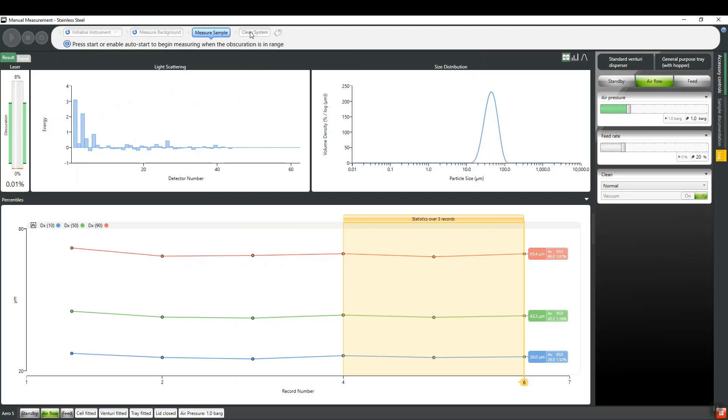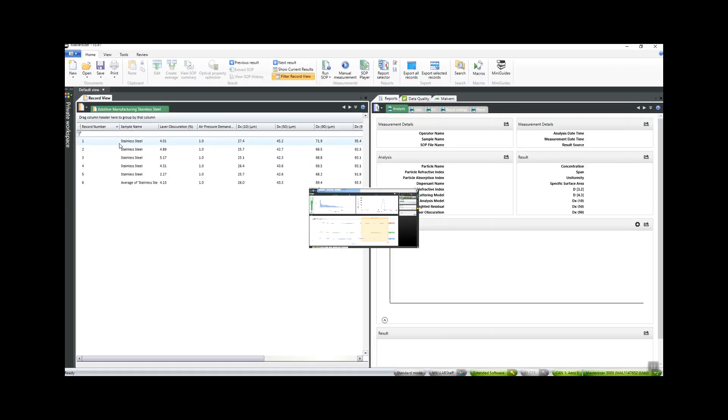Finally, the cleaning sequence can be initiated, and following that, the measurement window can be closed and the results reviewed.